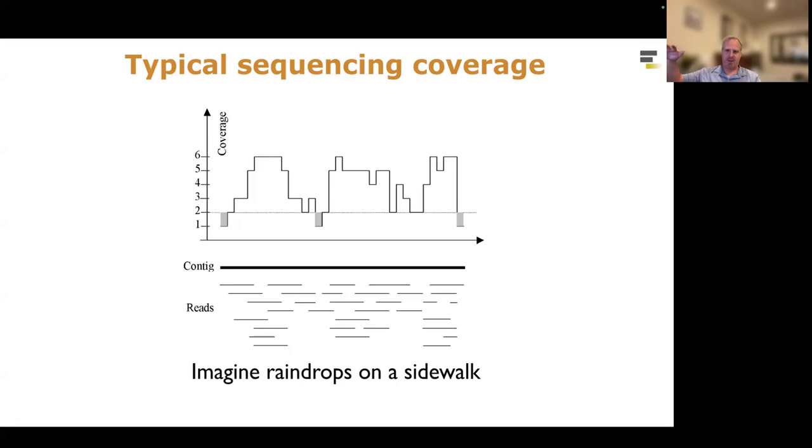The most crucial thing is that any place where the coverage goes to zero, we'll have no representation there, no reads there. It'll be impossible to assemble. But even at 1x coverage or 2x coverage, low coverage, there's going to be the possibility of more errors. If your coverage dips down to 1x, you're relying on a single read, which may have 5% error or more in the case of Oxford Nanopore, and that may be problematic if those higher error regions are incorporated into your reference assembly. So, for a lot of different reasons, we want high coverage along the way.